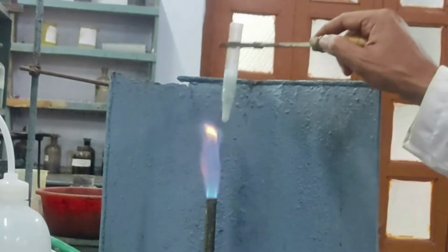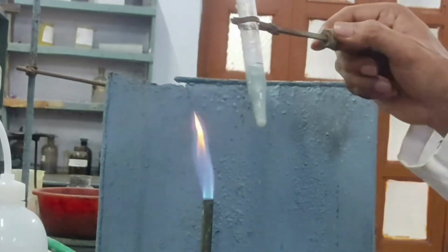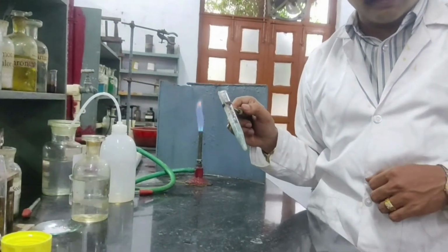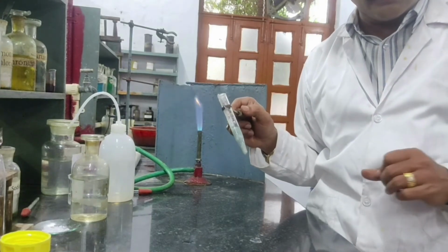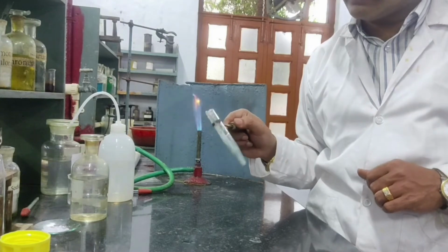So I boiled after adding sodium hydroxide for 1 to 2 minutes. Now I have to centrifuge this. If I get a precipitate, okay, or residue, that is indicating the presence of Mn plus 2. Okay, let us see whether there is Mn plus 2 in this.